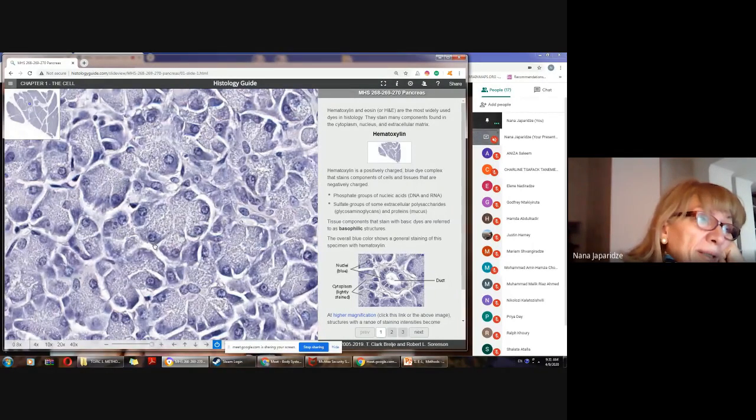So when we have in the nucleus prevalence of euchromatin, I mean light stained content, it means that this cell is very active from the point of view of gene expression, and it means that the translation process and protein synthesis is also very intensive in the cell.